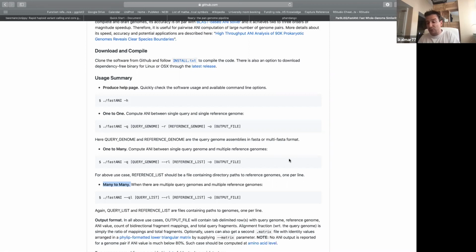So between two different species from the same genus, you will see a lot of matches, not as much as between two isolates from the same species, but you will have a broad picture about the whole organization of your sample. You can identify branches and genus-level clusterings within your sample. But that's all you should do with this kind of approach, nothing else.